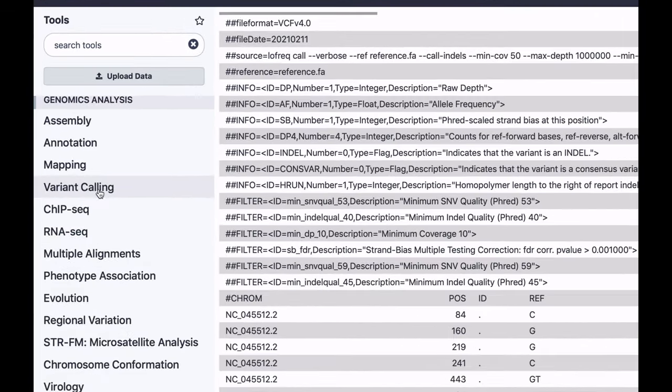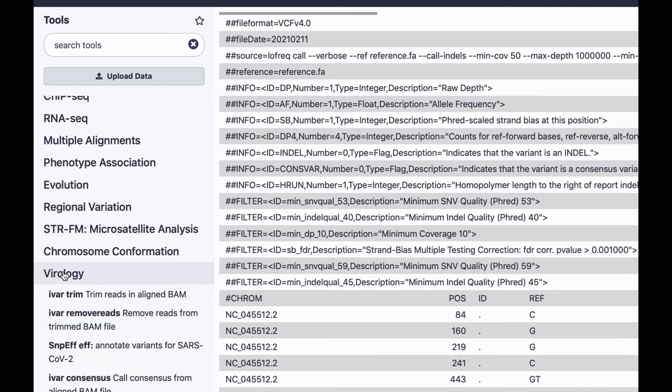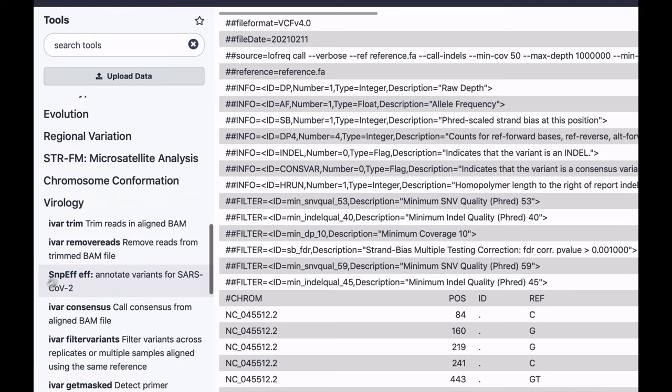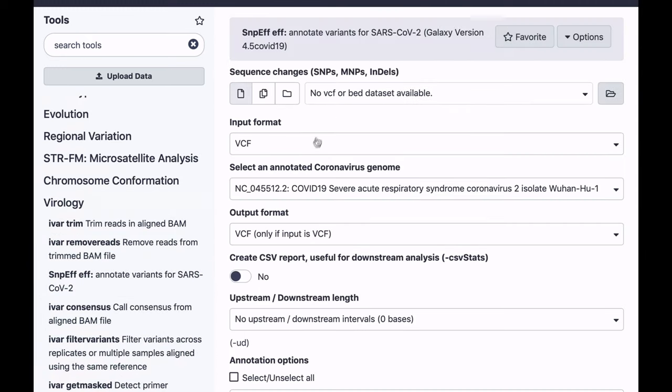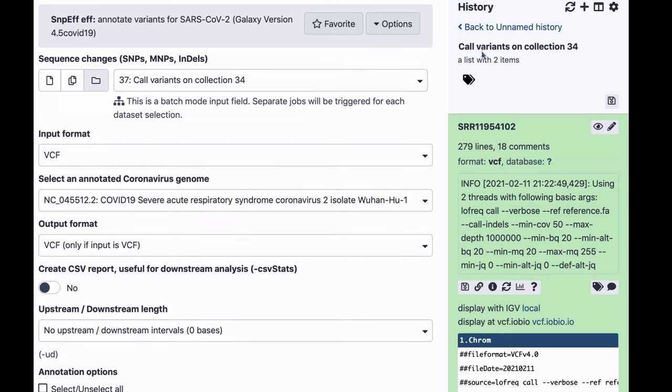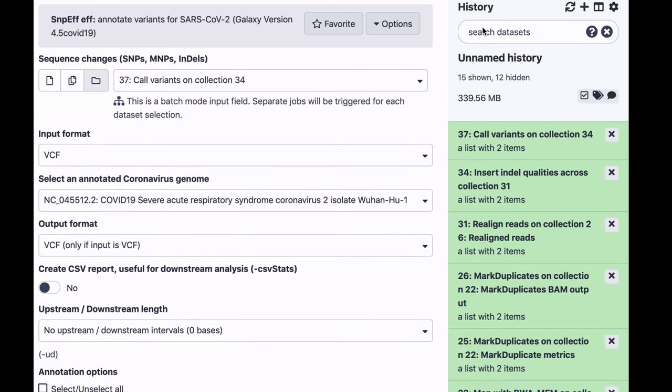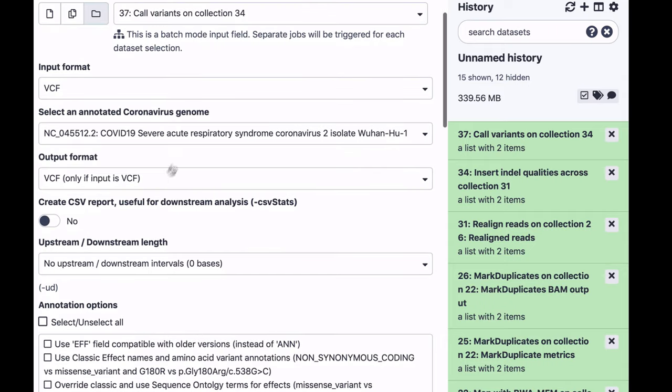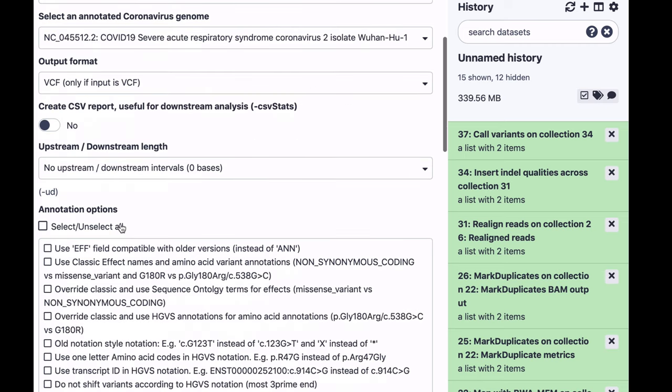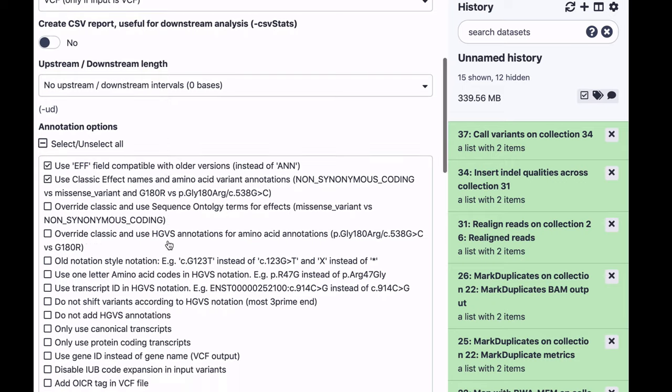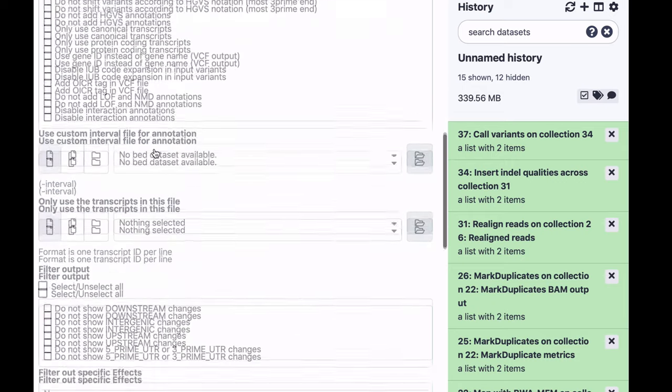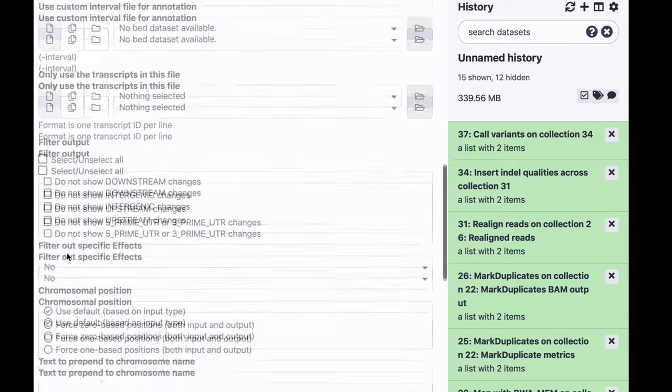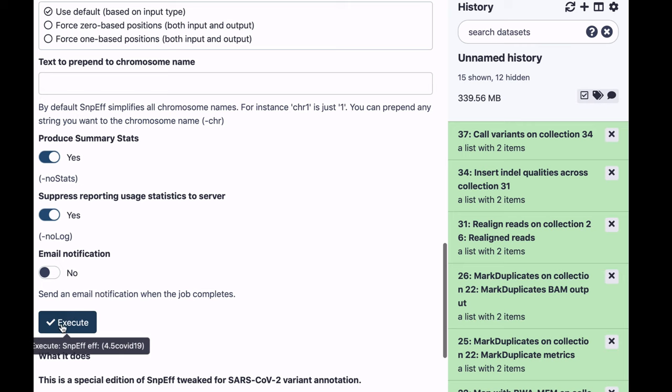For this we're going to be using SnpEff, but we're going to use a special version of SnpEff designed specifically for SARS-CoV-2, and it's found here in the virology section. So I'm going to choose that. Again input is this collection produced by LOFREQ. This is the correct version of the genome, version 2. I'm going to select these two fields, nothing upstream, downstream, nothing here, and just write.